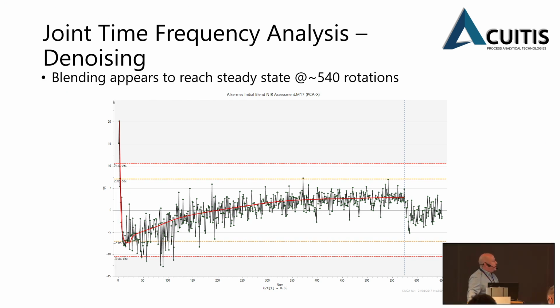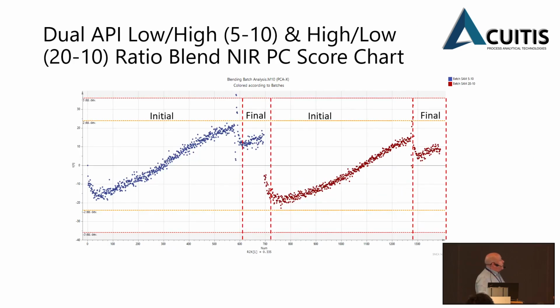In this case, that's been applied, and it's cleaned that data up enough to be usable. Not perfect, but we can still see the mixing dynamics and the endpoint occurrence within the actual blend itself.